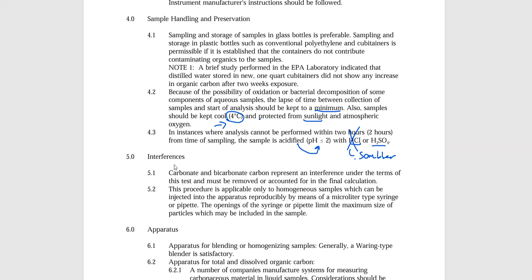When the lab gets it, they're going to take this container, and if they cannot get to it within around 2 hours, they're going to try to acidify it, and they're going to acidify it using preferably H2SO4 with us, or if you're crazy and you don't know what you're doing, HCl can also be used as well.